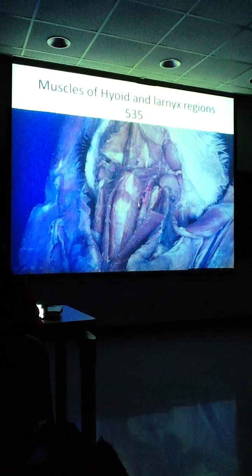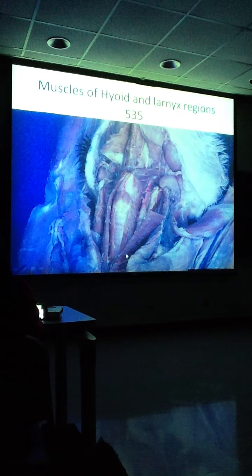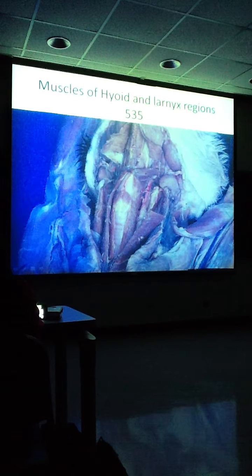Here's a side view that shows us exactly what we just saw, Mr. Gilmore. Here's the cute one that's been cut. What's the name that's been cut? Sternohyoid. If there's sternohyoid, then this fellow right here is sternothyroid. This one right here is thyrohyoid, Mr. Gilmore. This one has to be cricothyroid. Mr. Gilmore, these pictures are good. You need to let me have these. Can't do it.